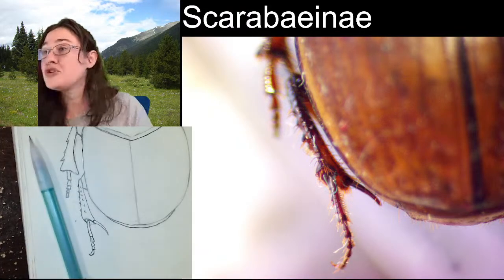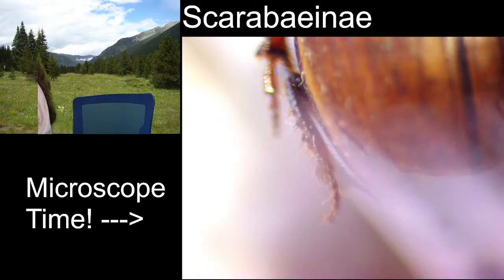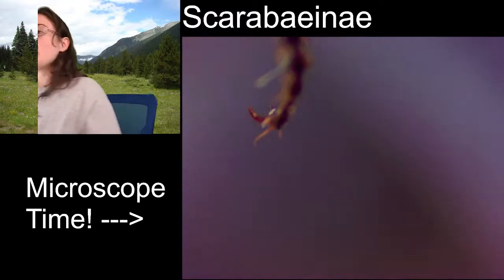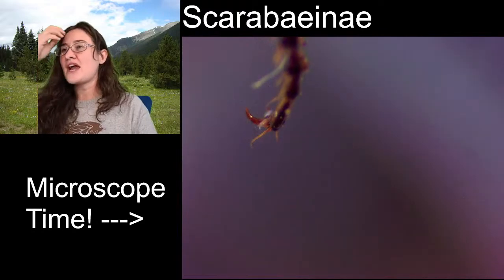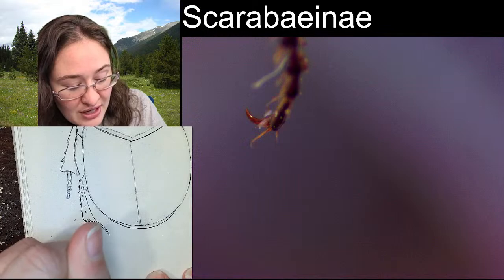I do believe the hind leg has some pretty strict tarsal claws, so let me go and check that out, make sure I'm right. Yeah, so it's a little bit more difficult to see from this angle, but there you can see kind of the shiny sharp point there. There are tarsal claws at the end of those hind legs.